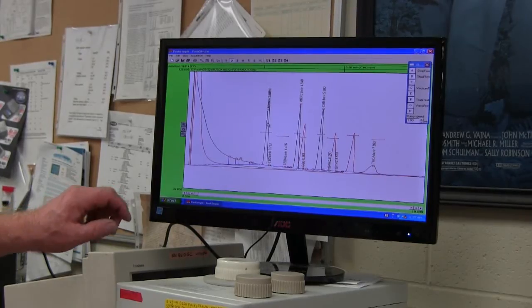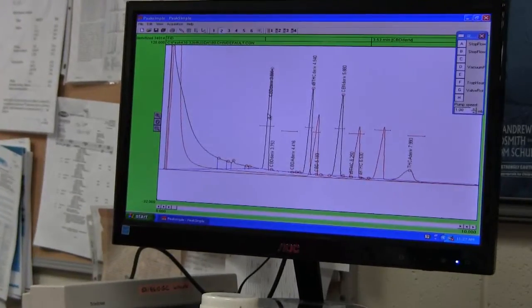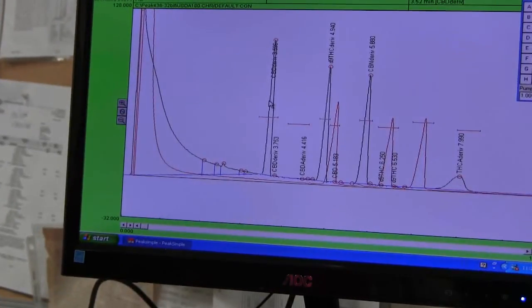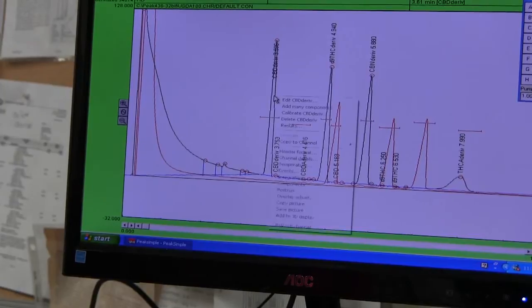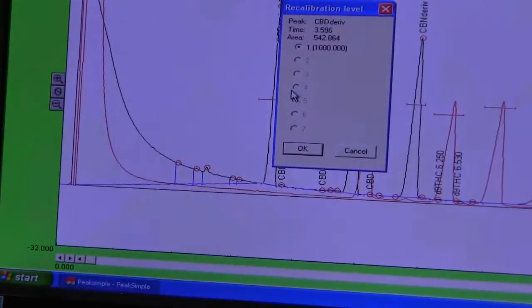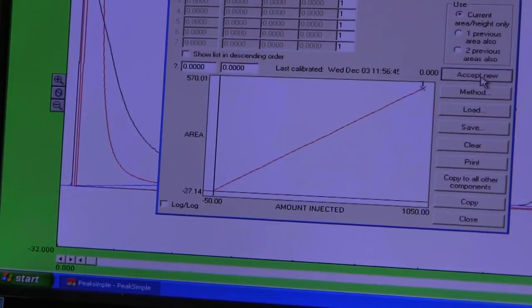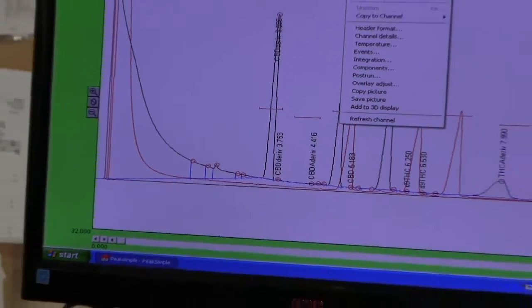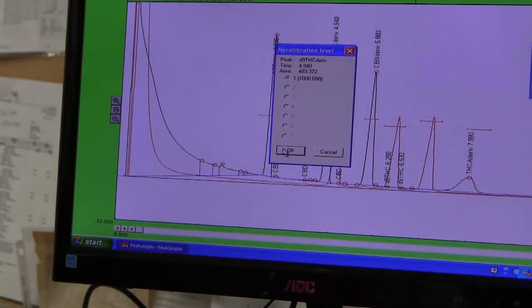So what we need to do is to calibrate the derivatized CBD, delta-9, and CBN. And we do that the same way, by pointing to the peak, calibrating the derivatized peak, accepting new and close. And we do that for each of the three derivatized cannabinoid peaks.